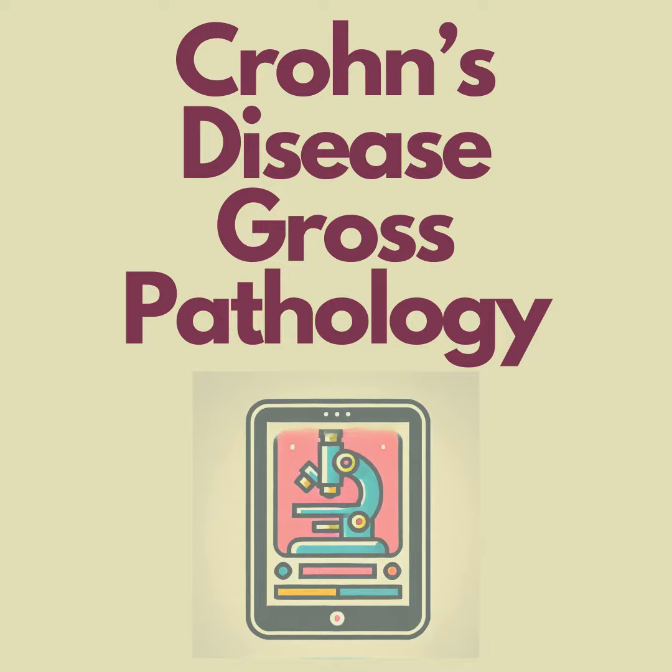Yeah. Most people think of Crohn's disease as something that you take out the ileum and cecum for, and not a subtotal colectomy. Right, exactly. And we'll get into that a little bit later. But first, let's just orient ourselves a little bit and make sure that we're all looking at the right organ. Yes. So if you're handed this specimen in the lab, how do you know that you're looking at a large intestine and not a small intestine?